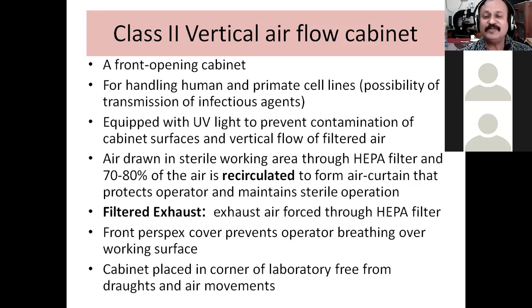And therefore now I'm saying again that when the air is recirculated, it actually means that filtered air is recirculated again, and therefore you can assure that the air which is coming into the cabinet is really very, very clean, isn't it?